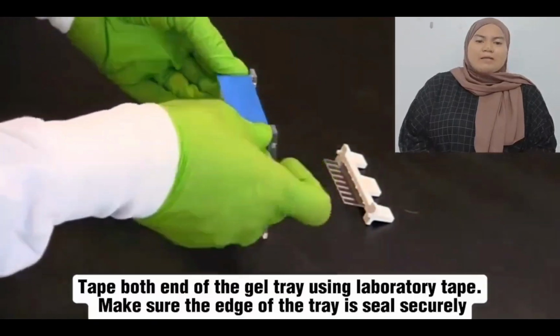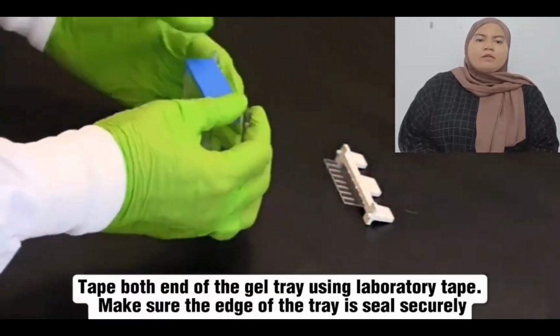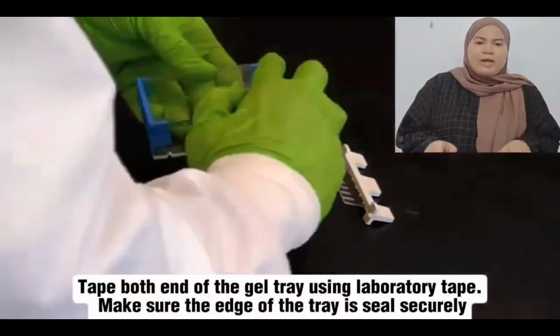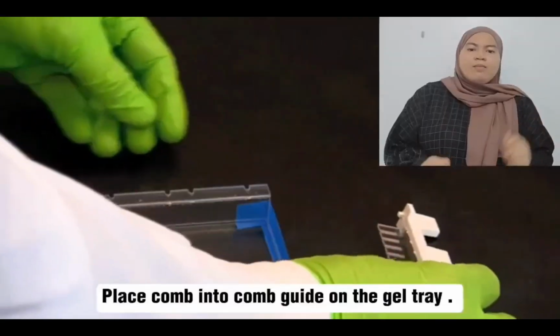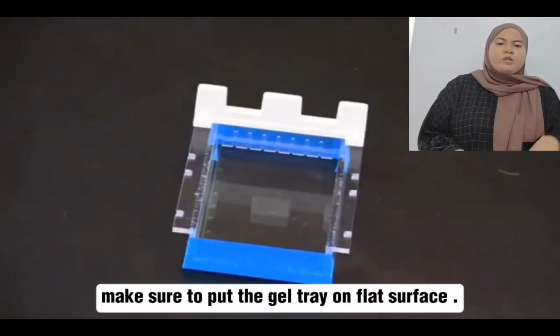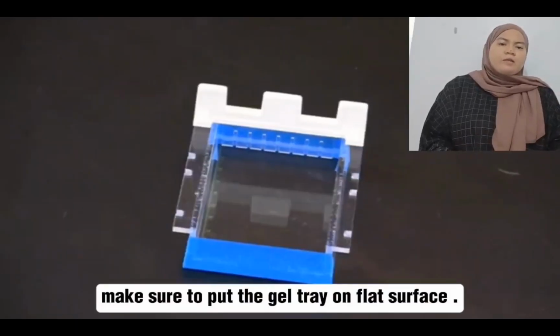Okay, so next we're going to talk about the gel casting process. The first step is to tape both ends of the gel tray using laboratory tape. Make sure the edge of the tray is sealed securely. Place the comb into the comb guide on the gel tray. Make sure to put the gel tray on a flat surface.